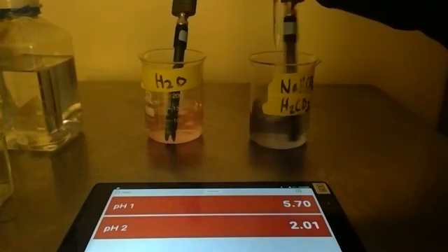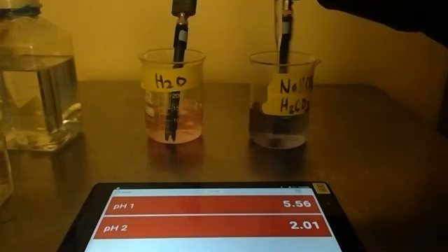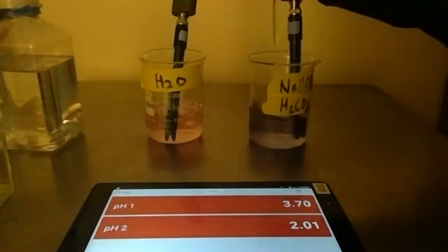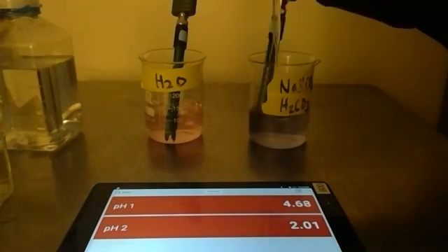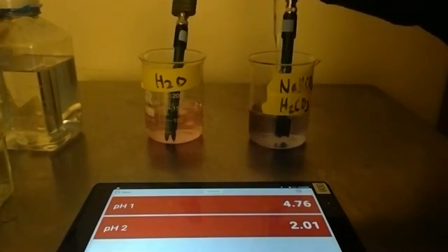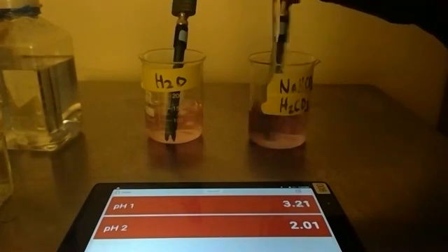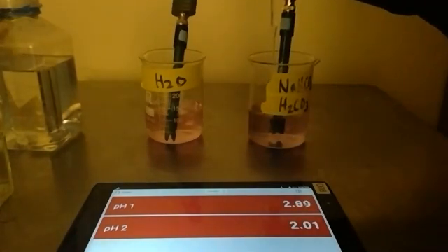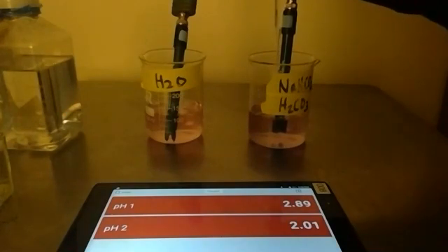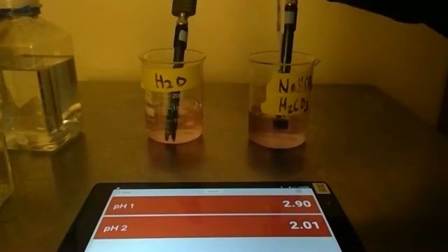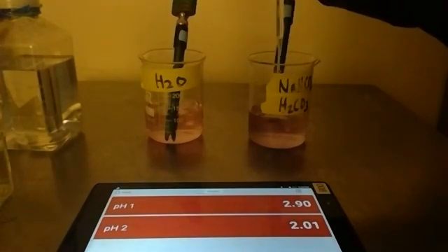We dropped all the way down to 4.78. 11, 12. We might be reaching our buffer capacity. We just jumped down to about 2.9 and we see a color change. After the, I believe that was the 12th drop, we are now down to 2.9 and we have reached, we've definitely hit our buffer capacity. We saw rapid change of about over a pH, a whole pH or more. And we see this color change.